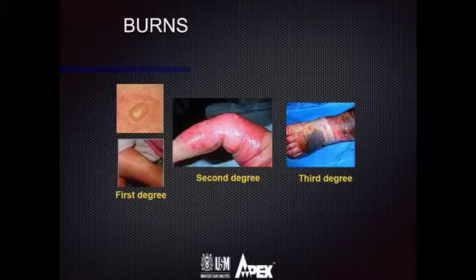Well, the main reason for us to actually extinguish the fire is this. As you can see, we have burns. And in fact, it is not really a nice picture to show. And in my experience during my tenure, during my service, I've seen too many burn victims. And it doesn't come only from fire. It can be chemical reaction, it can be abrasion, it can be so many other things that create that heat that burn the skin.